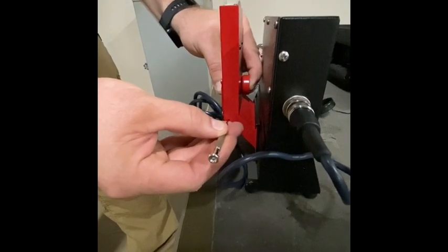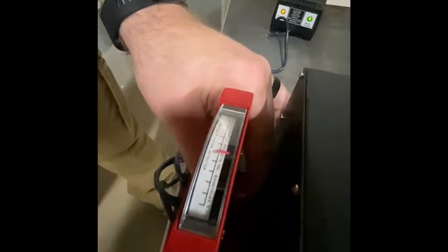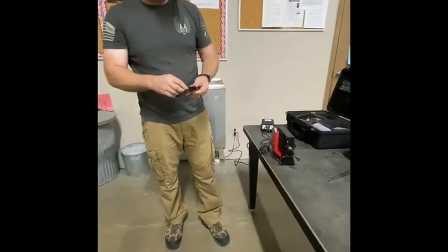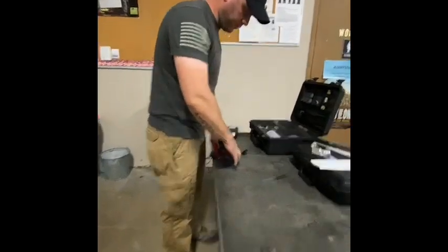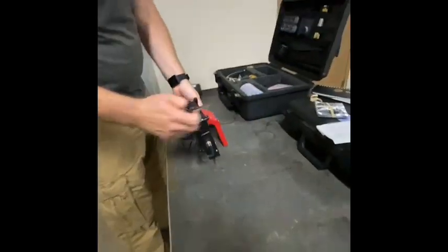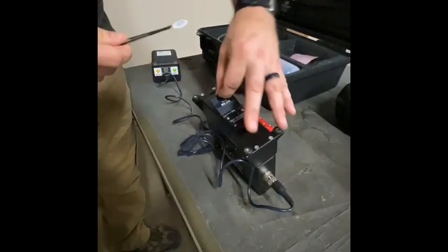And you turn the screwdriver until the dial on the top is at 0. And now it's calibrated. Okay, once it's calibrated, you run that back to 1. Remove the test pad. Again, only using tweezers.